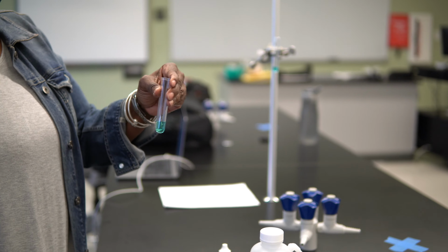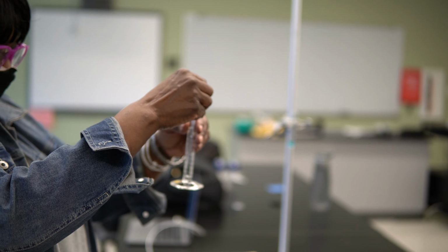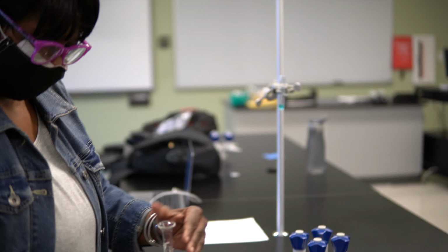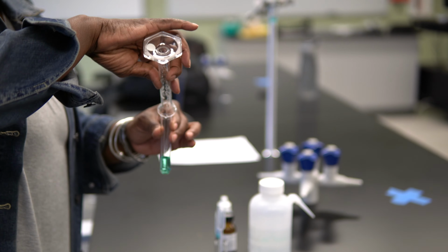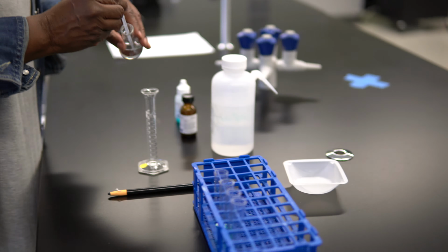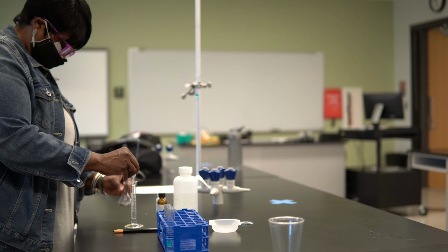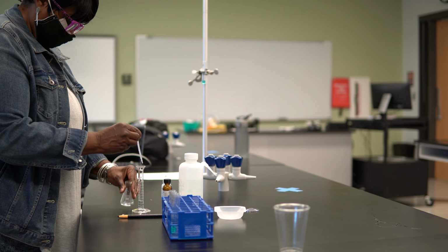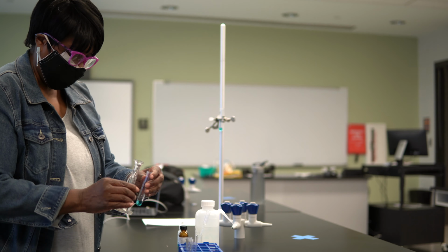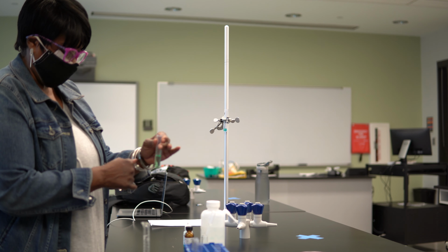Add 2 milliliters of concentrated salt solution to test tube number 3. Add 4 milliliters of concentrated salt solution to test tube number 4 and also test tube number 5. You will need both of these tubes for temperature comparisons later in the lab.